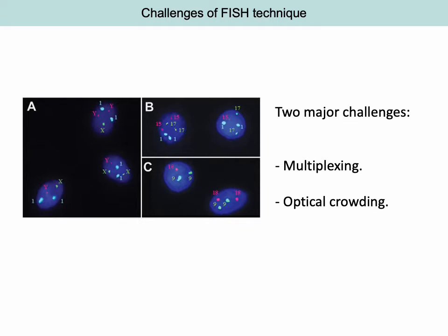Another problem is that on the microscope you have this optical crowding issue, because each dot is diffraction limited, so you can only FISH a limited number of dots in the cells.